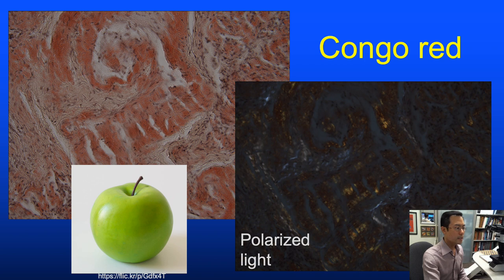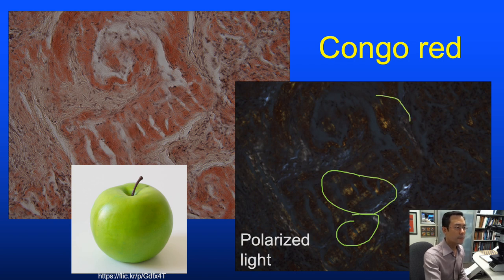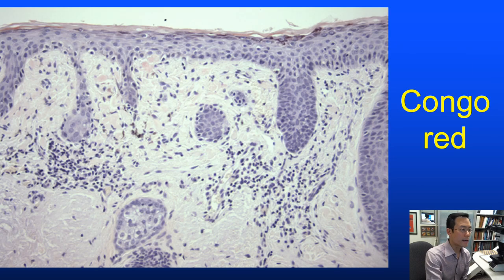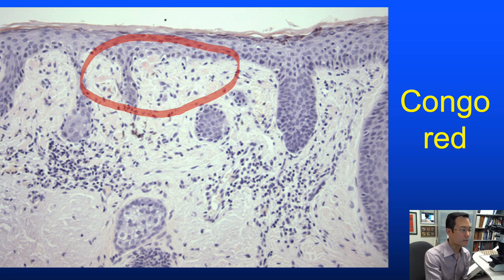Here's the Congo red positive stain, and under polarized light we see what could be described as apple green—though I've seen this sometimes in regular collagen fibers. Here's the Congo red stain on a case of macular amyloid; there's some weak staining in the upper dermis, but if it's not staining well or is negative, I won't rule out macular amyloid—it's pretty much an H&E call.